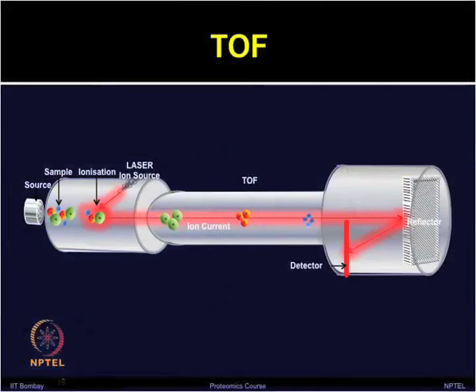In TOF, the ions are accelerated to high kinetic energy, and due to their different velocities, they are separated in a flight tube. One can also use the reflectron mirror, so that ions turn around into a reflector, which compensates for minor differences in kinetic energy and provides a long separation path.